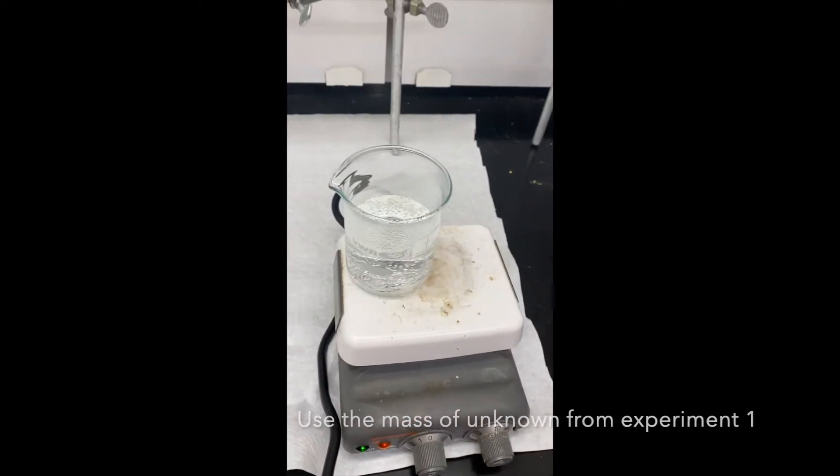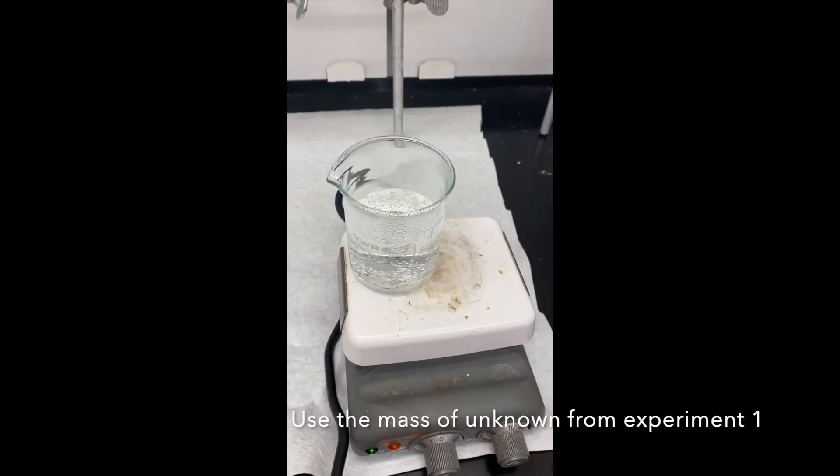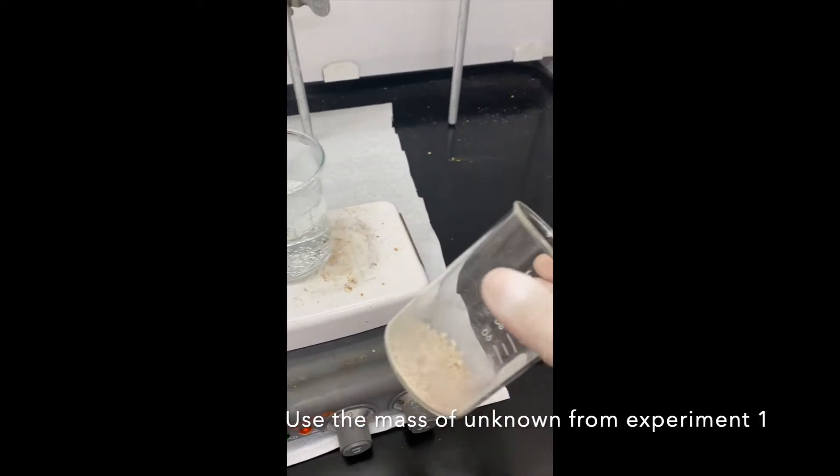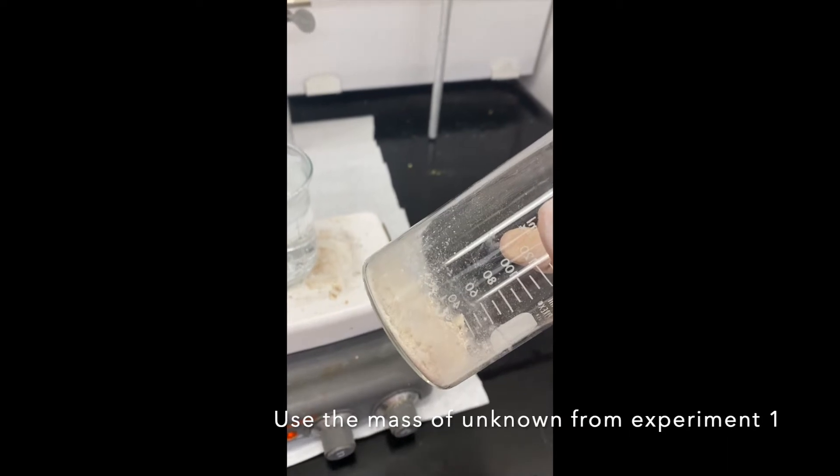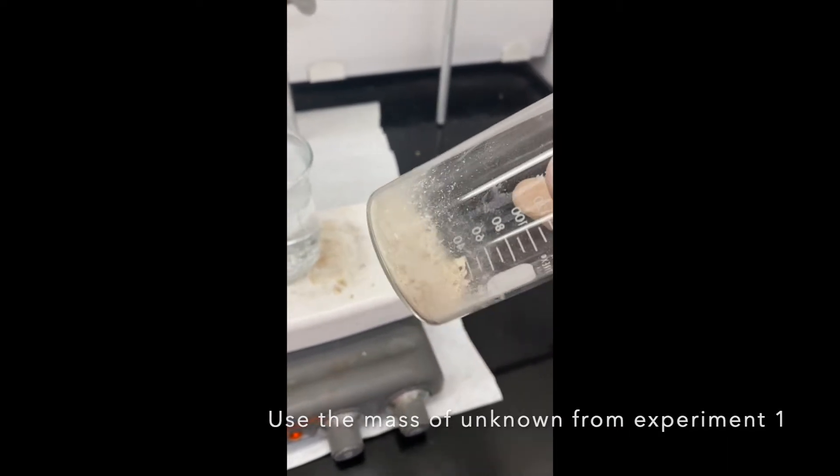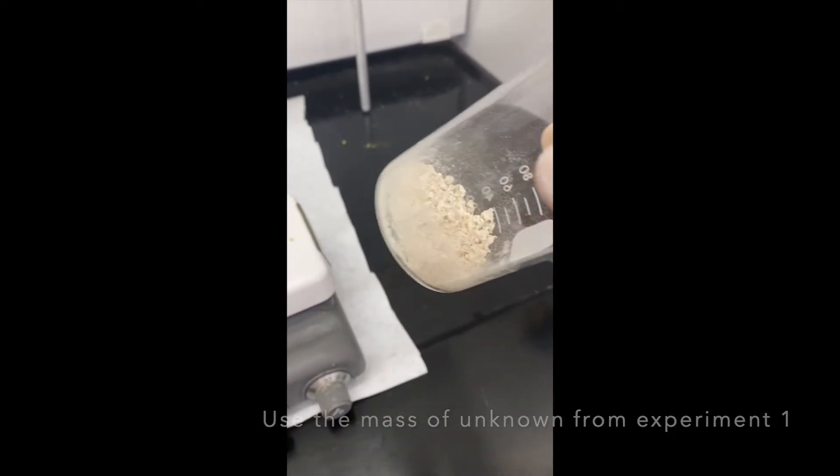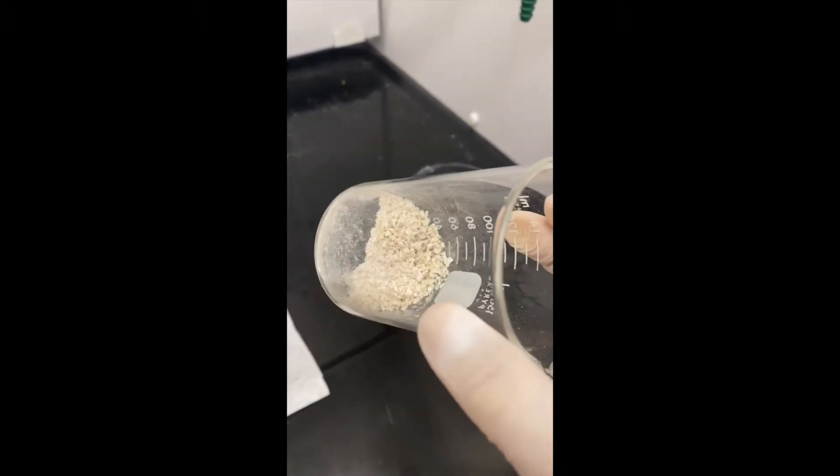All right, so the next step to our experiment is to recrystallize our element. Anytime you do a separation, you probably notice that in the separatory funnel that separation wasn't perfect. You might see that as a result of some kind of discoloration.